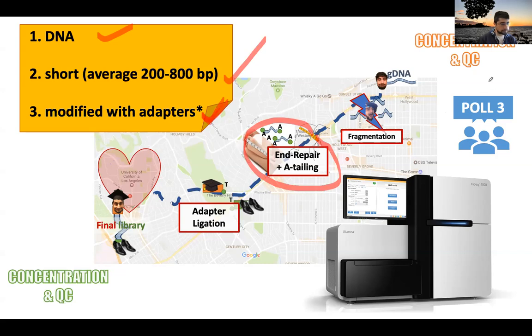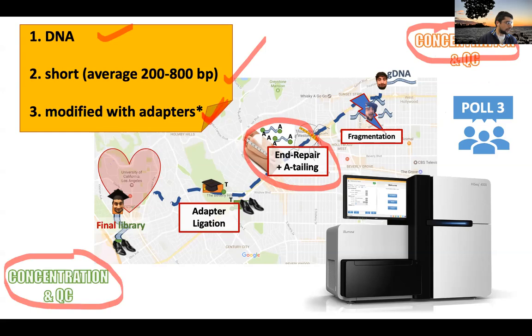I've also added concentration and QC at the beginning and concentration and QC at the very end of the library preparation. We usually perform at least a concentration measurement at the beginning of our library preparation, and then at the end, to check if the library worked okay.